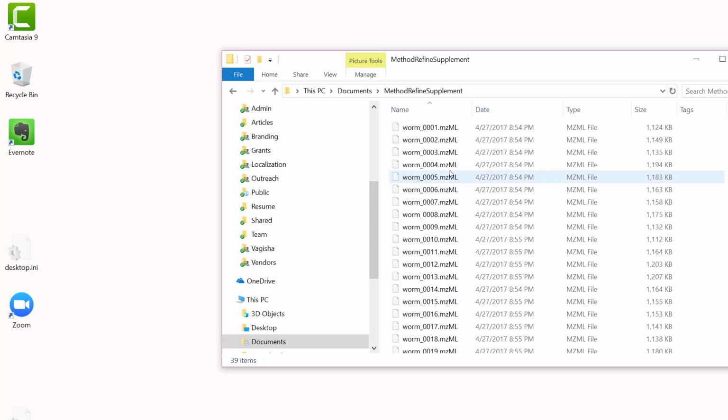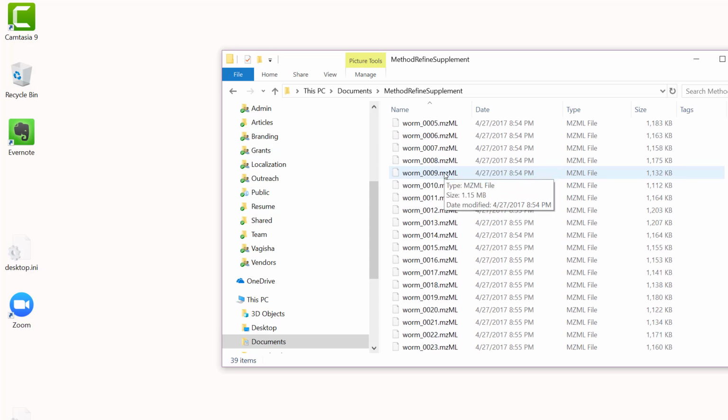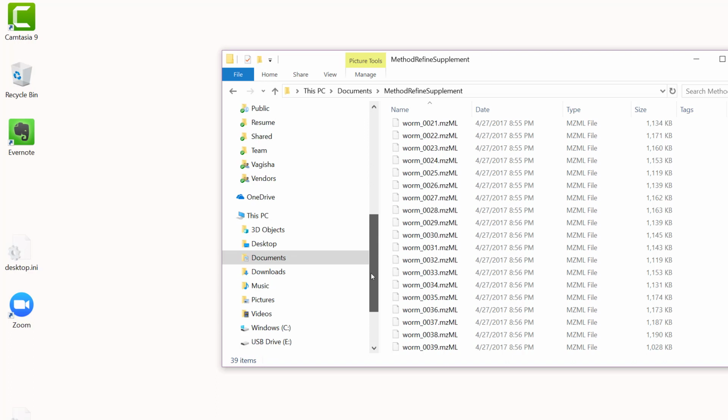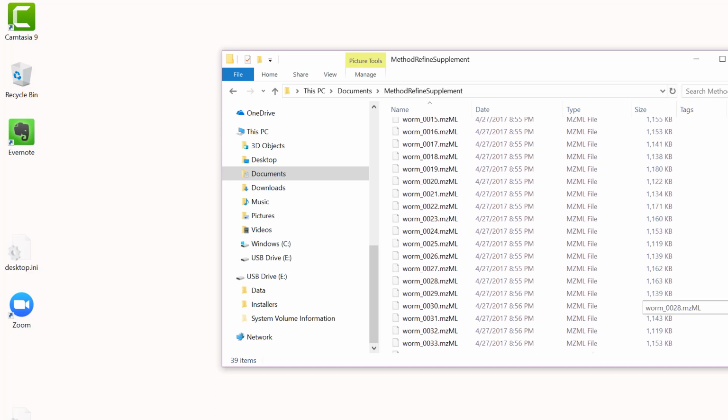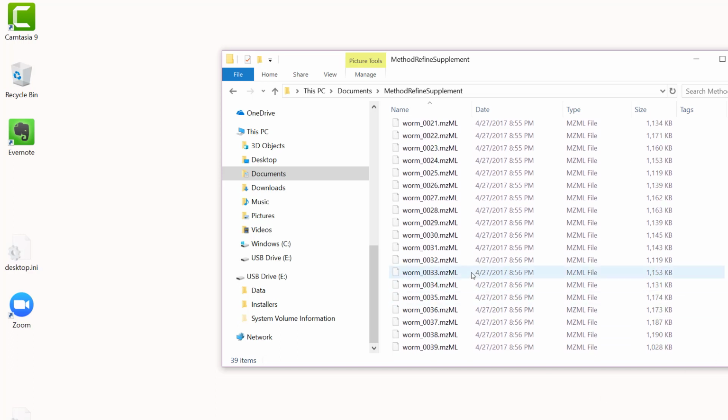So these are individual measurements of peptides that we're interested in. Yeah, we went over exporting multiple methods to cover a document. People remember that? So we exported 2 transition lists because we couldn't cover everything in a single transition list. And so these 39 mzML files come from exporting a single document.